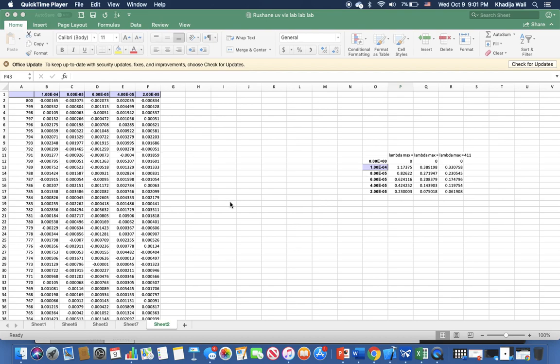To help this process go quicker, I've already organized my table where I have my wavelength and all the different concentrations generated from the experiment, with the absorbance collected under those different concentrations. In case you're given those concentrations in percentages like I was, you have to convert them to concentration. But all this information I will show in another video.